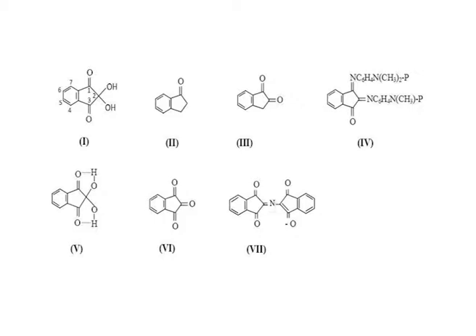When heated in vacuum or when treated with thionyl chloride, Ninhydrin dehydrates to 1,2,3 indane trione. Compounds such as those shown on your screen, having a vicinal triketonic function, are also useful for developing fingerprints, although the results are not as good as that of Ninhydrin.